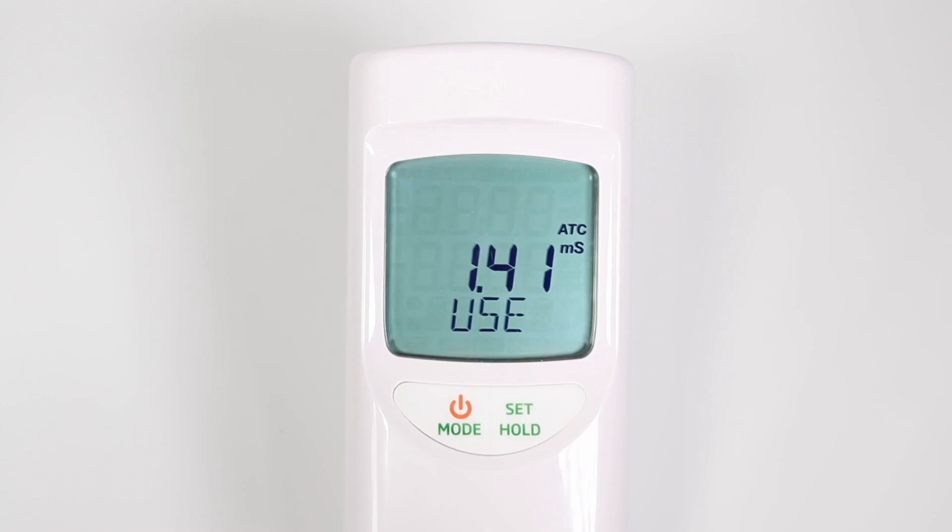If the standard value is recognized, REC is displayed. Then wait blinks until the calibration is accepted. The LCD will display save for one second and return to normal measurement mode. EC/PPM calibration can be done less frequently than pH calibration, with minimal drift over time. Calibrating every one to two months is recommended.